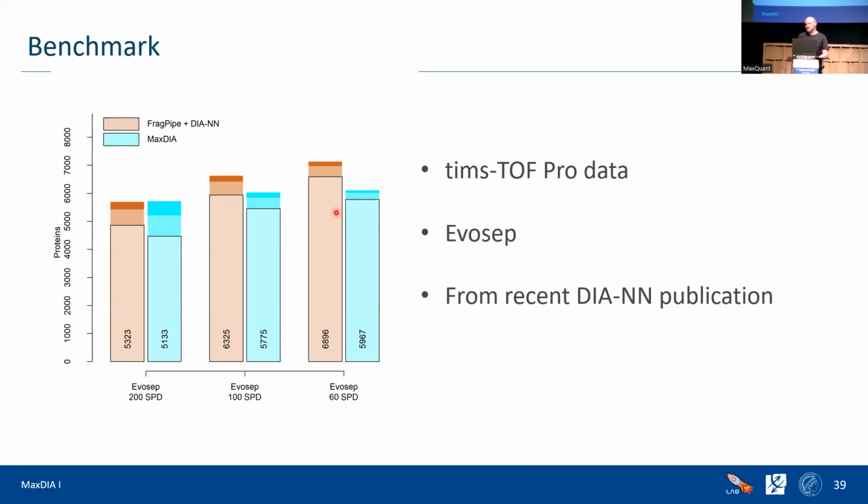Okay, great. And if we use it for phosphoproteome analysis, can we later download the library as a spectral library produced by MaxQuant and use it again later? Because the library production itself takes a very long time. You mean to export the library from the DIA data with the DIA information? Exactly. No, that's also coming. That's not there yet.